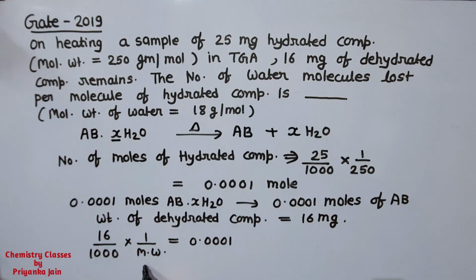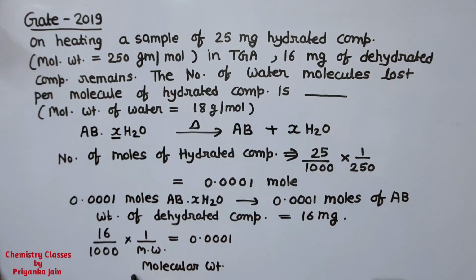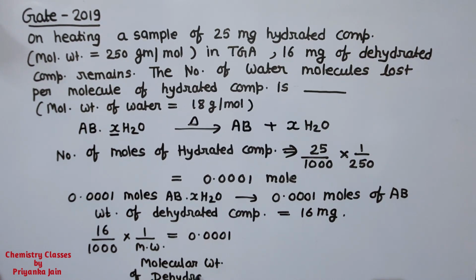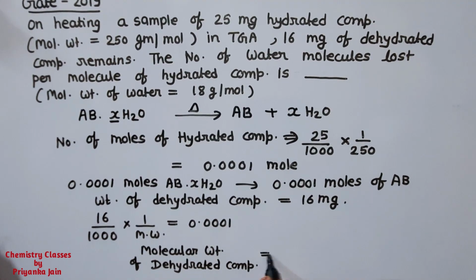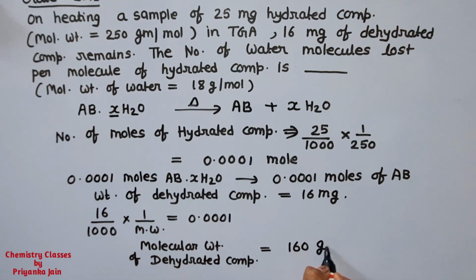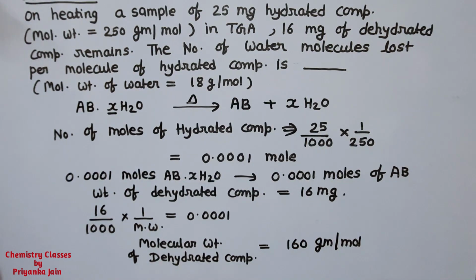From this we can find out the molecular weight of the dehydrated compound, which will be equal to 160 grams per mole.